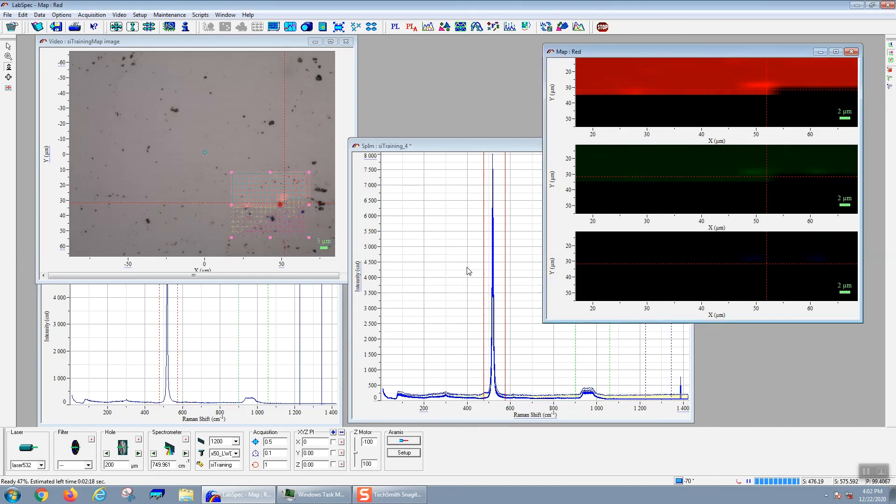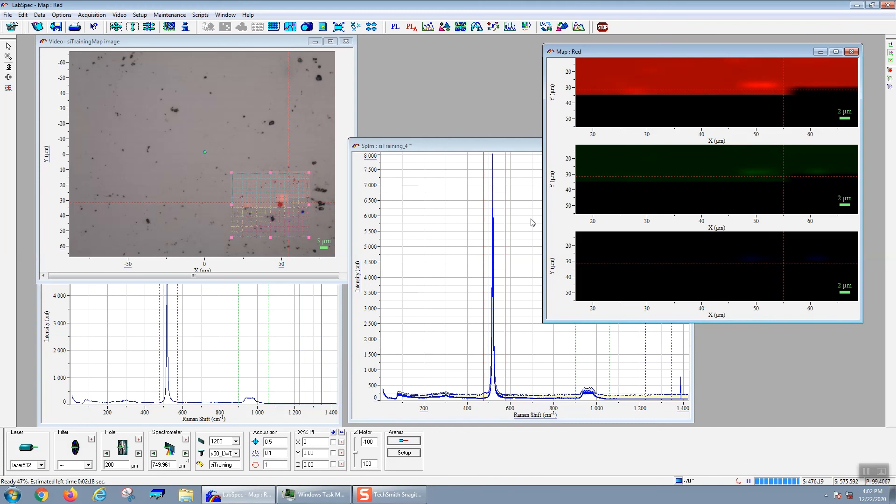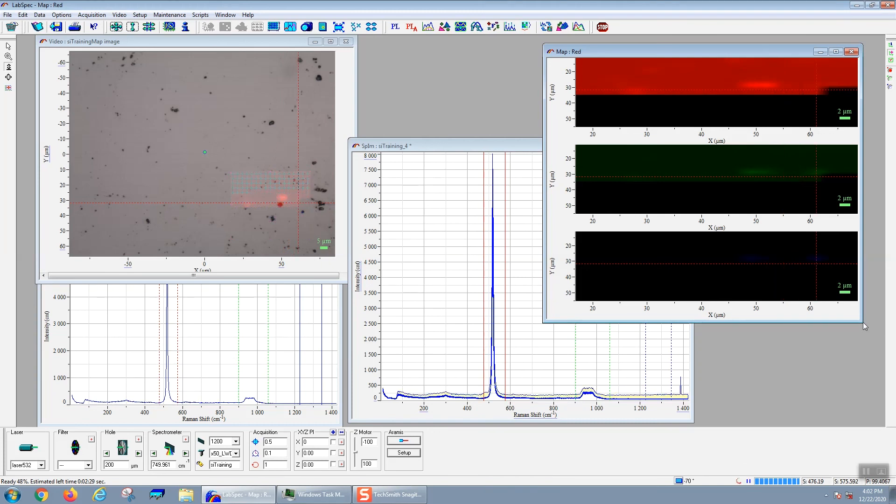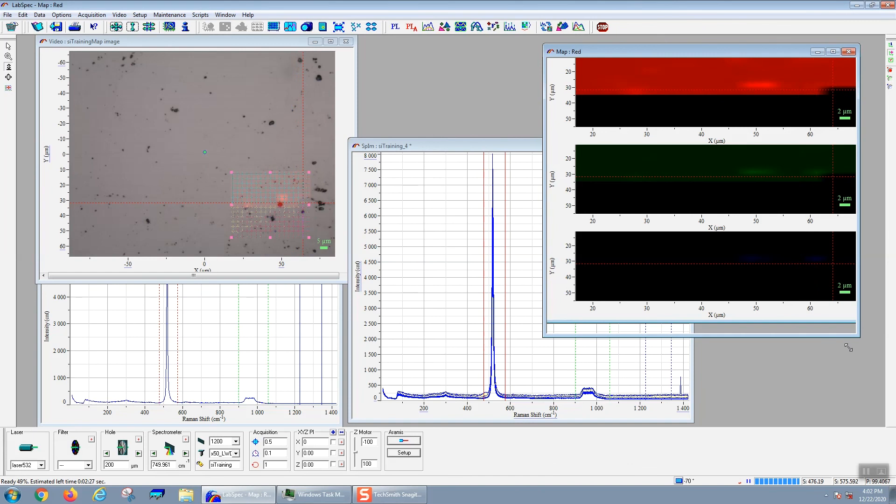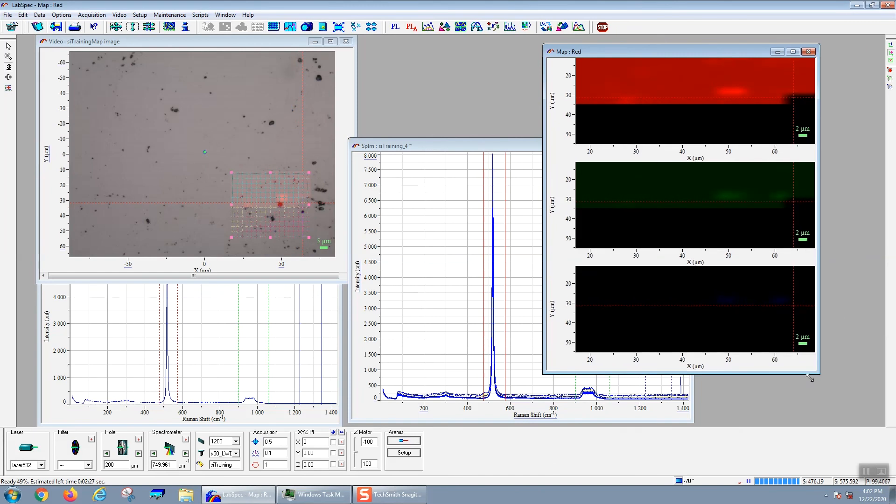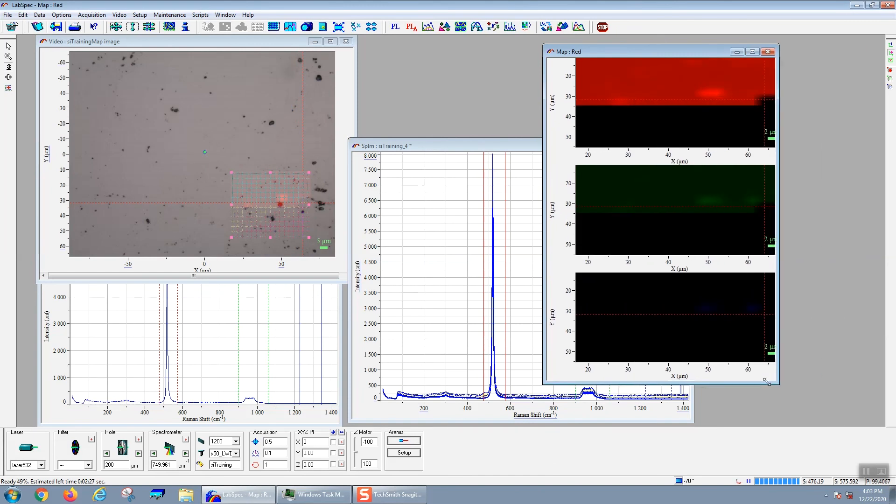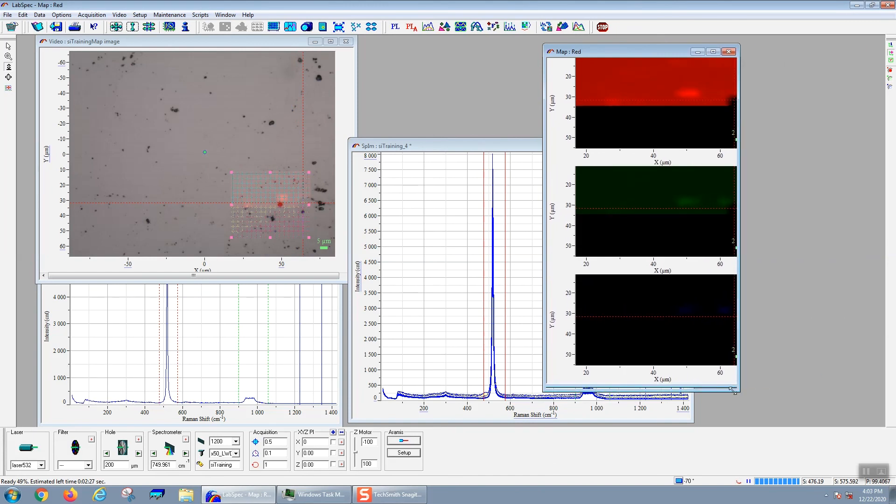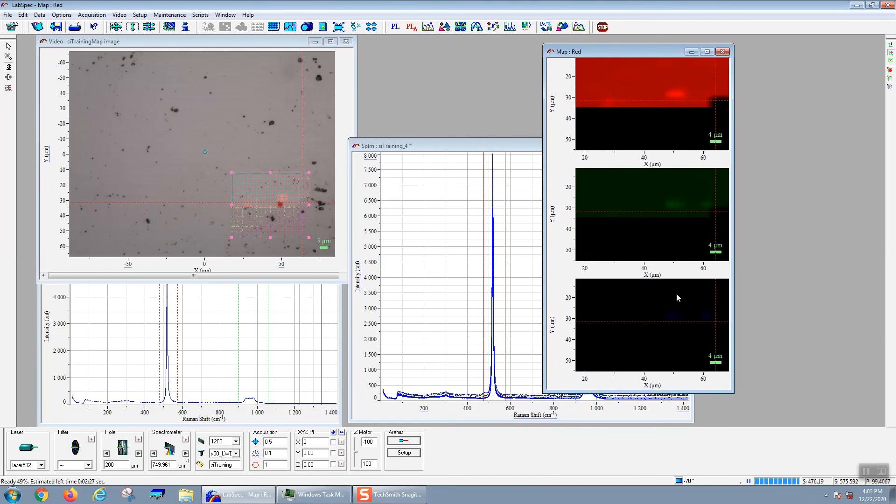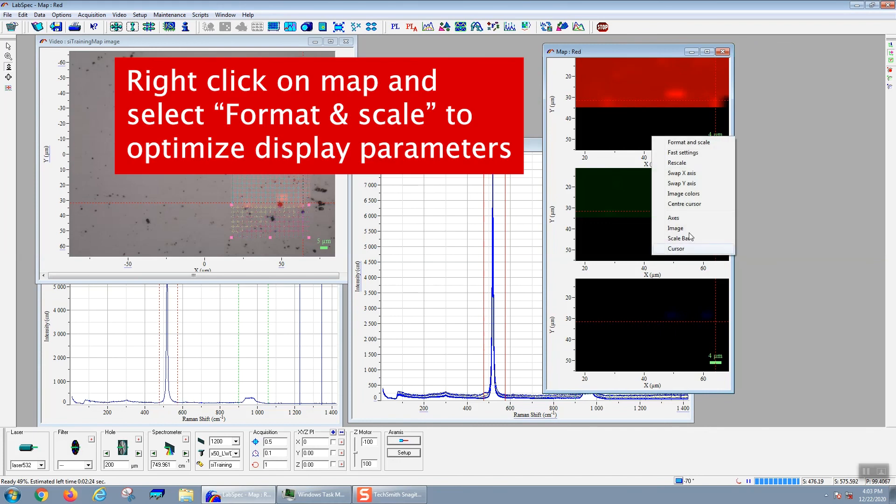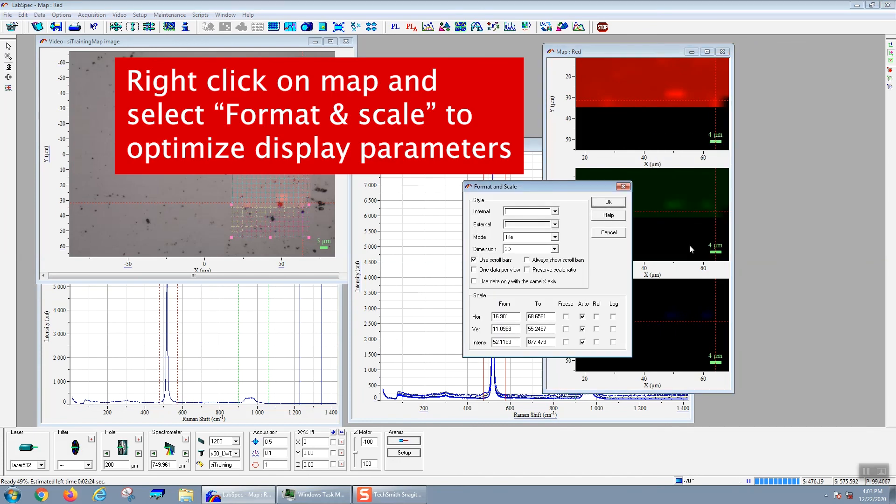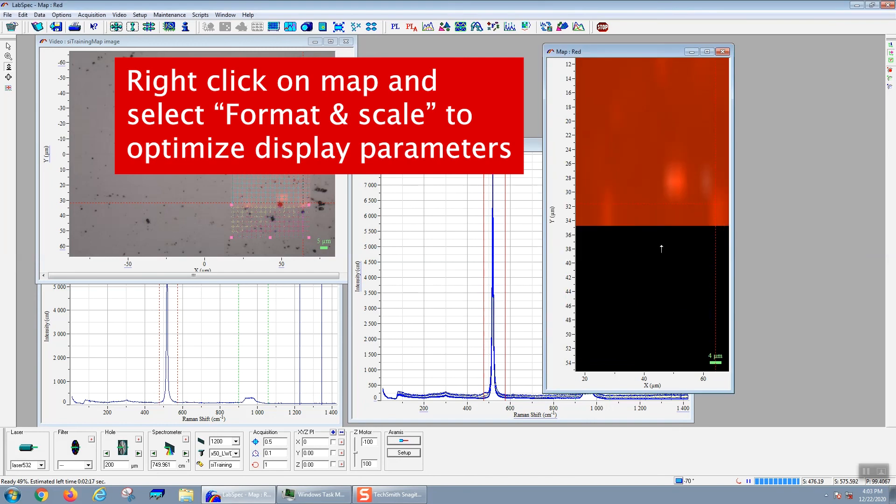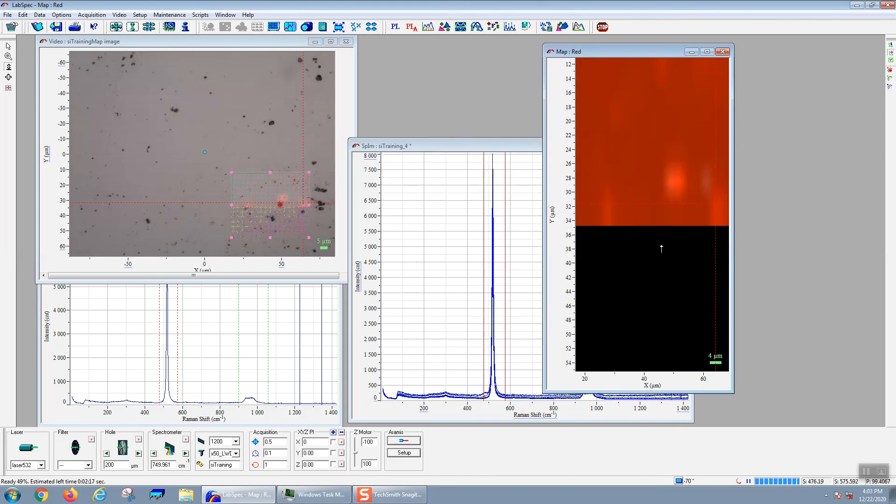Hopefully by this time your map is progressing a little further. You also may want to set some of the visualization parameters. For any graph or image, you can right click on that image or graph and then select format and scale. Here you can set how you visualize the maps. In this case, we're initially seeing the three different maps as three different colors. But you can also select overlay and that would make some sort of multicolored image. But generally, it's more useful to select tile.